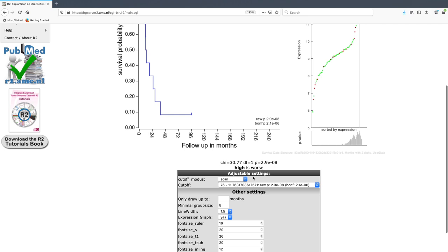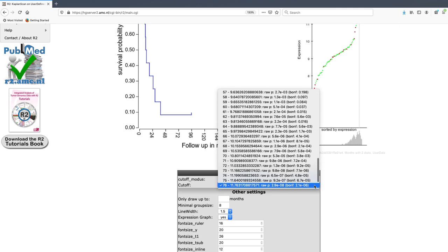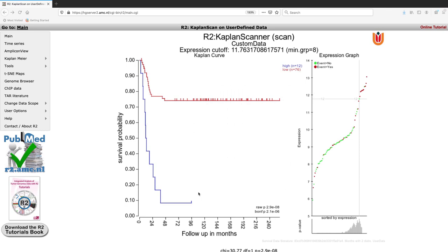However, you can choose to alter the method of cutoff definition - for instance, choosing median or average expression, or setting a specific cutoff if that is what you wish to do with your own data. So now we've looked at how you can extract data from R2, as well as how you can enter your own data to perform analyses such as Kaplan-Meier or survival analyses, or creating your own sample annotations or tracks within data that is already in R2.